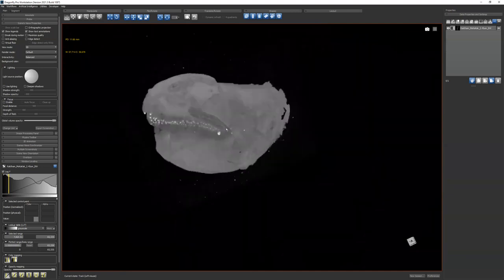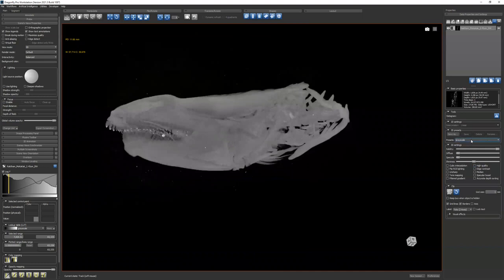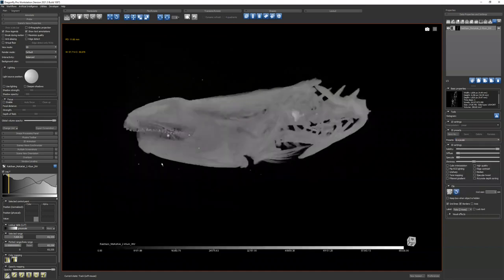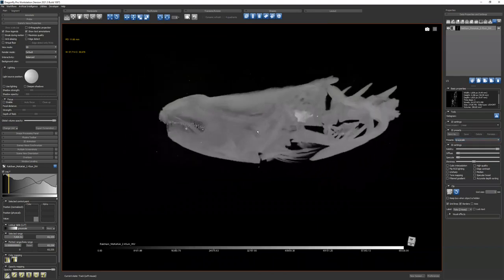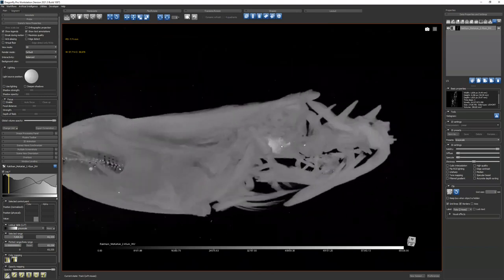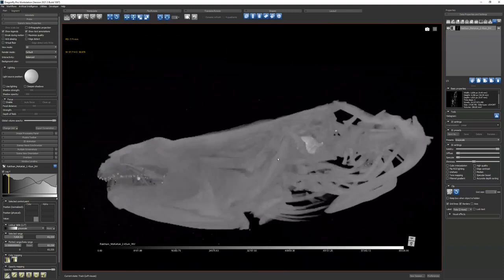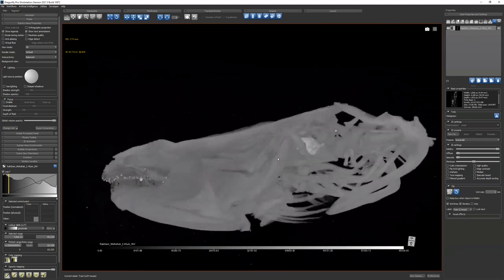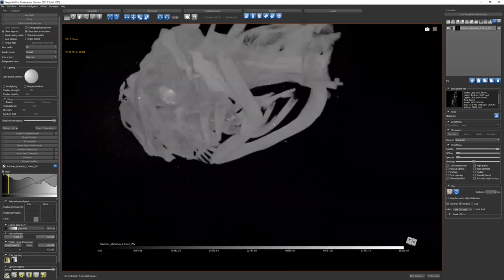When you have your data, you can render it in a bunch of different ways, make it look a bunch of different styles, colors, everything like that. You might want to get just an overview like this. Maybe you're happy just seeing the skull like this, or the entire body, or whatever you've scanned. But usually what you want to do is pick out parts of your scan and show or highlight just certain regions, like certain bones, certain suites of bones together. And that is what we are going to talk about right now, the basics of doing that.